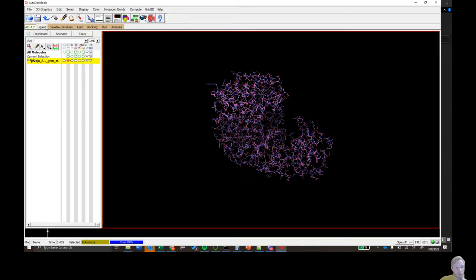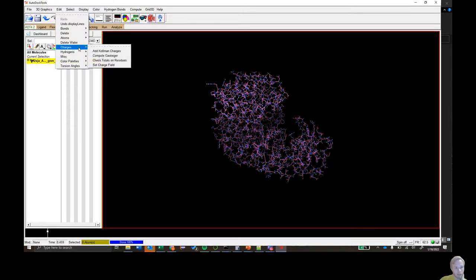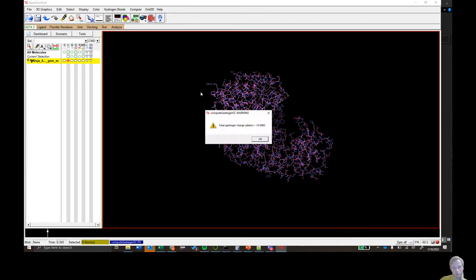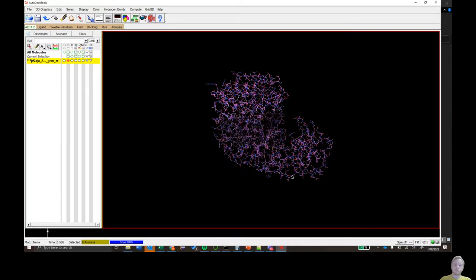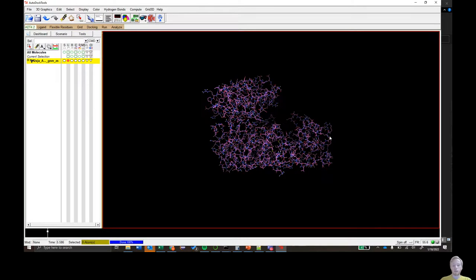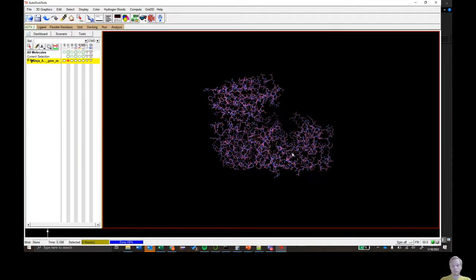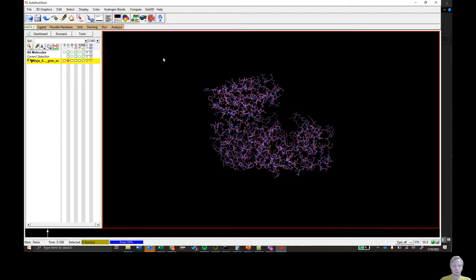Next, go to Edit, click Charges, and click 'Compute Gasteiger'. A number will pop up — it varies depending on your structure — and you just click OK. The reason we do this is that the software needs to know the charges of each atom to evaluate how well the drug binds. There are other charge methods you can use, but this is all you need to worry about for now.